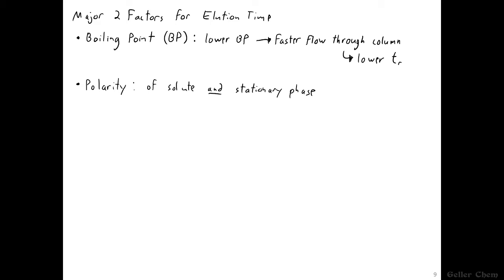Applying that version of the phrase, what we can say is that a polar stationary phase interacts with a polar solute more. Again, like interacts with like.